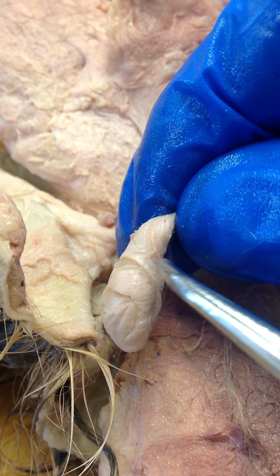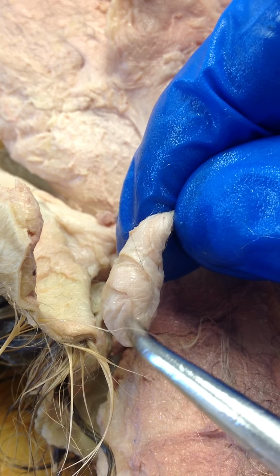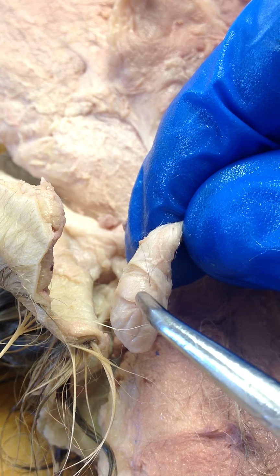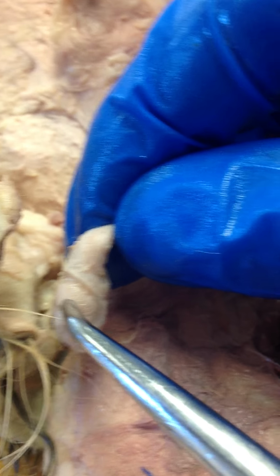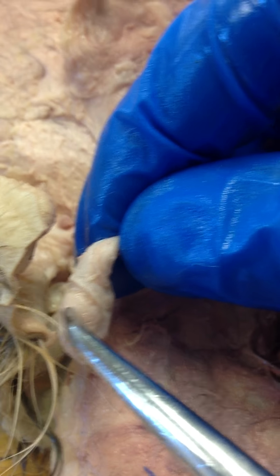Here, this part that's sort of laying on top of it is the epididymis. Whatever, you know what I mean. Those aren't hairs, they're just from the outside. See how there's one layer and then it goes to another? You can sort of see where they split here.